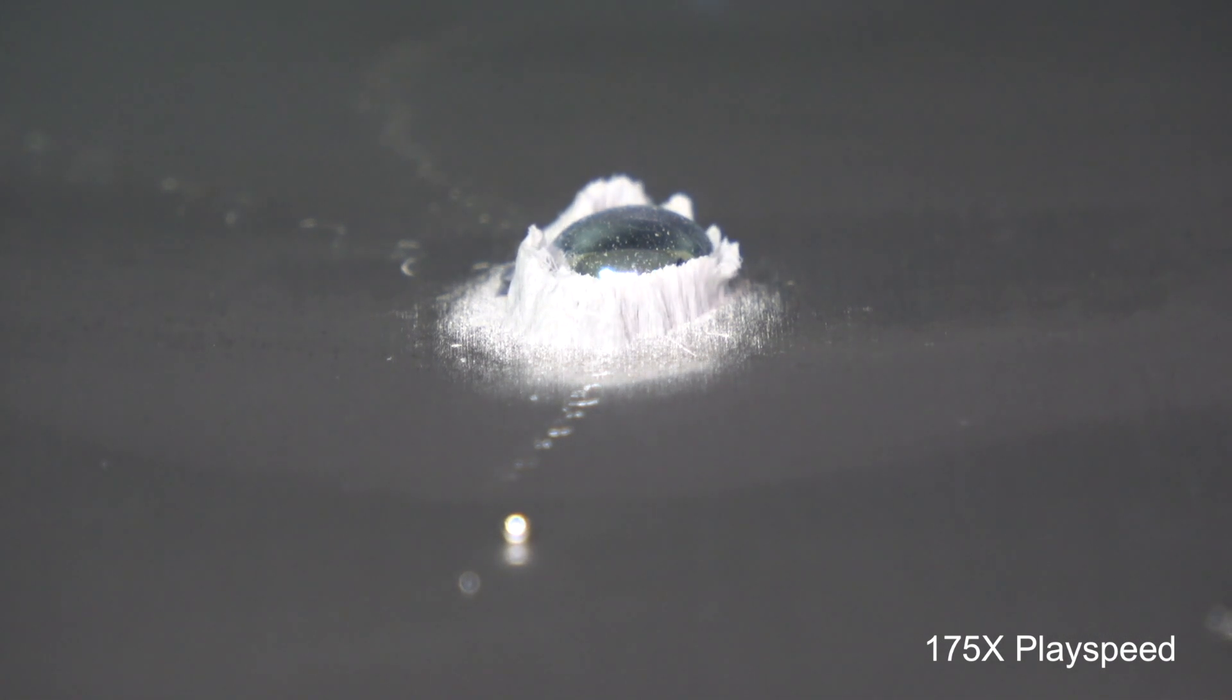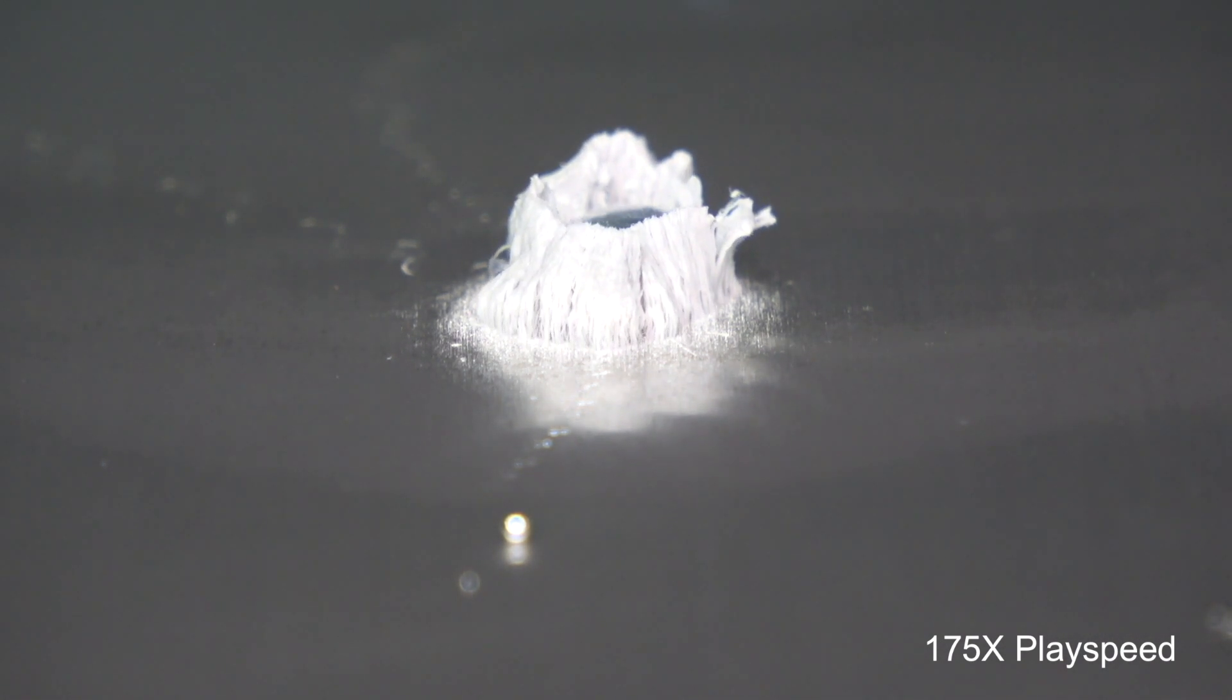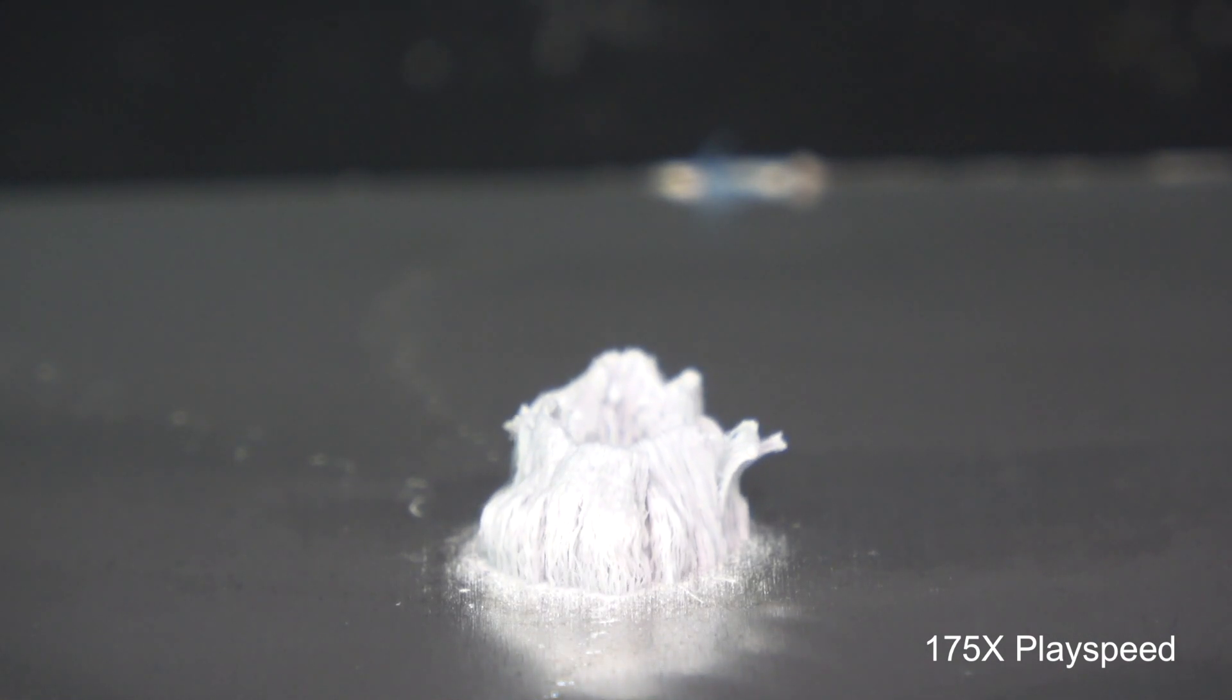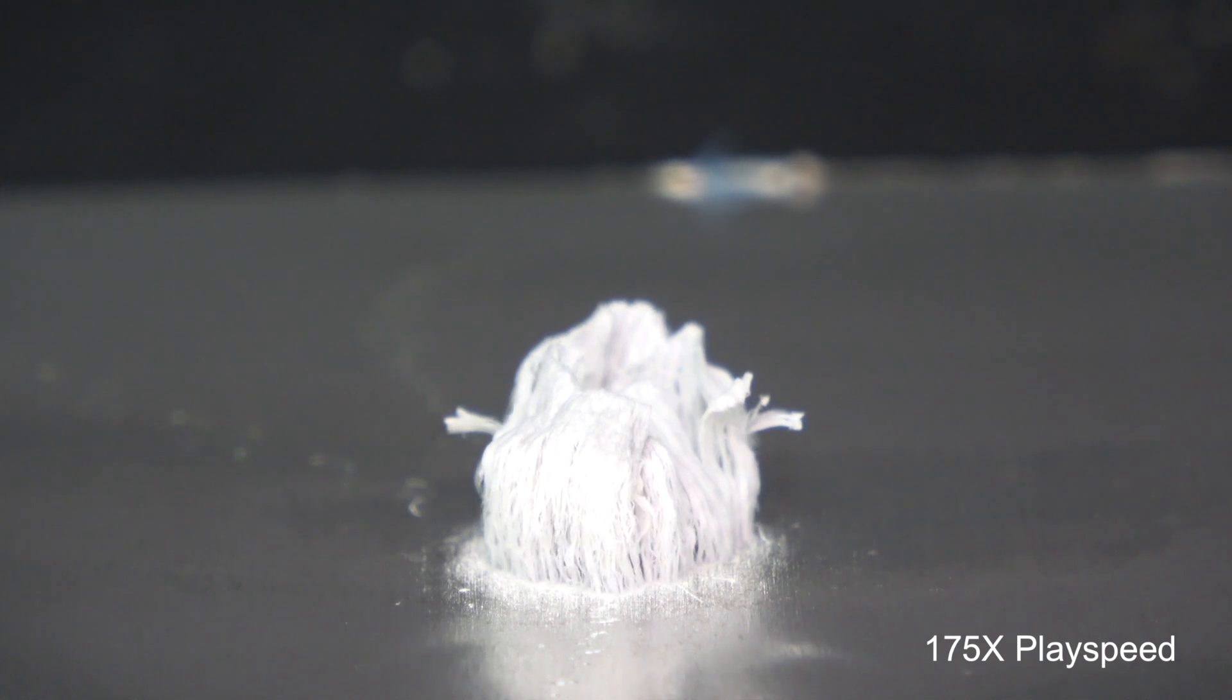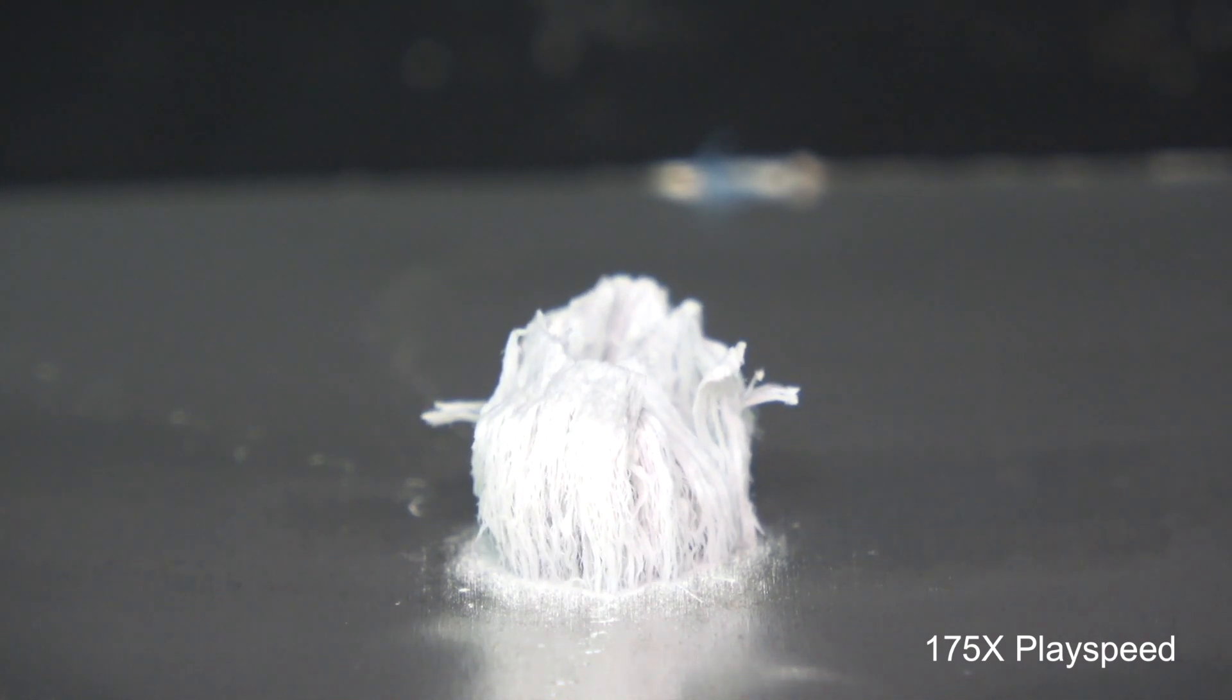And just like what happened in the previous video, the mysterious white fiber appeared once again around where the mercury droplet is. This time though, since all the mercury is at one spot, the effect it creates looks a lot neater.